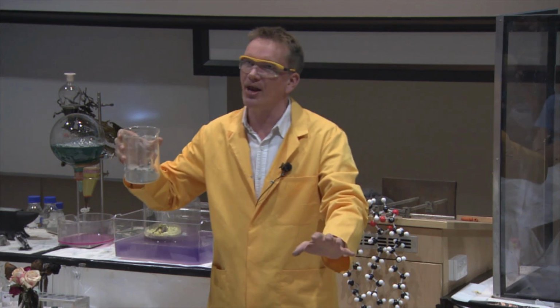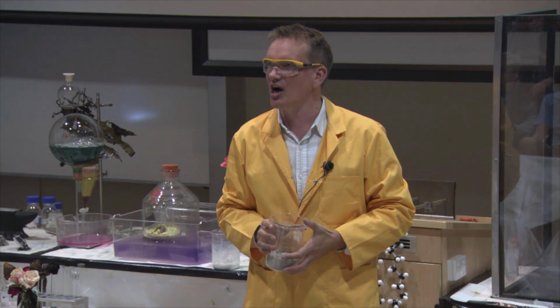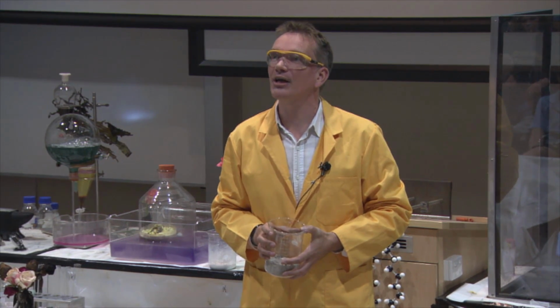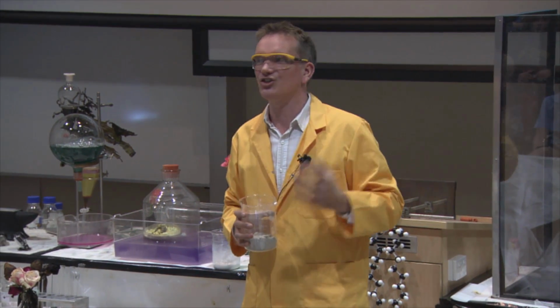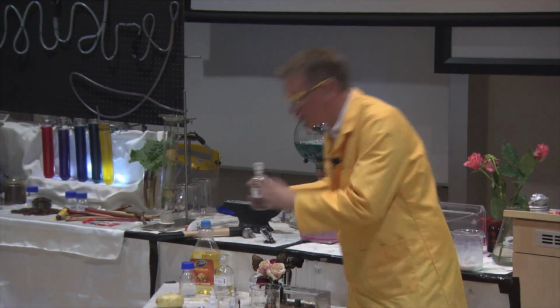And because it's a carbonate, remember, what's the test for carbonates? What happens when we add acid to carbonates? What happens? Anyone remember? Yep. It fizzes, yes. And why does it fizz? What's the gas coming out of the carbonate? Yep. Carbon dioxide. Well, let's try it then. We'll add some nitric acid to our ash.